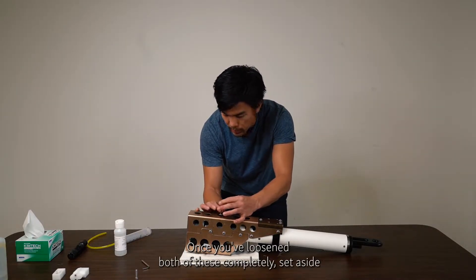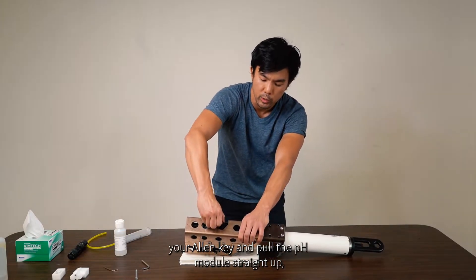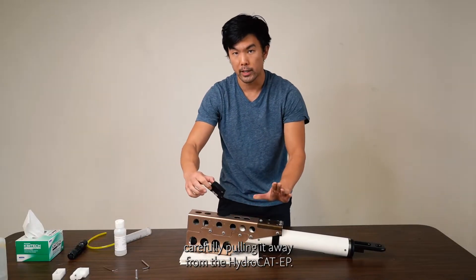Once you've loosened both screws completely, set aside your Allen key and pull the pH module straight up, carefully pulling it away from the HydroCat EP.